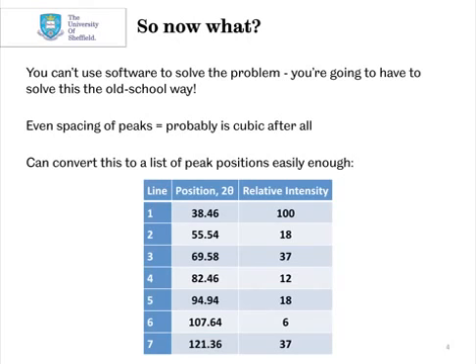As you can see here in the table, we've got our 7 peaks from the diffraction profile, and we've listed the peak position in 2 theta and the relative intensity. What's important is that as we go through this exercise, you'll notice I don't refer to the relative intensity at all. Everything we're going to do is purely from the peak position.